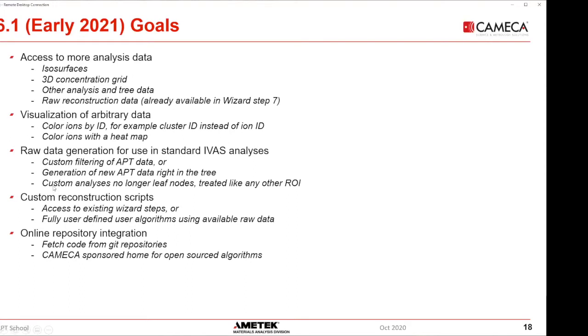Also, we're going to give you the ability to, correct me if I'm wrong, Dave, is this still coming in 6.1? The ability to... as long as you can get it done in time. Yes. The ability to also have a similar plugin for the reconstruction steps as well. So the custom analysis stuff will be available in APSuite Lite when that comes out.